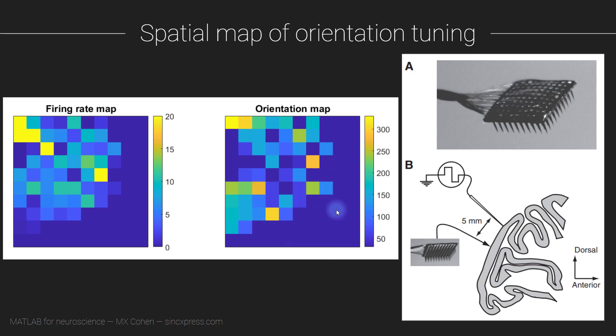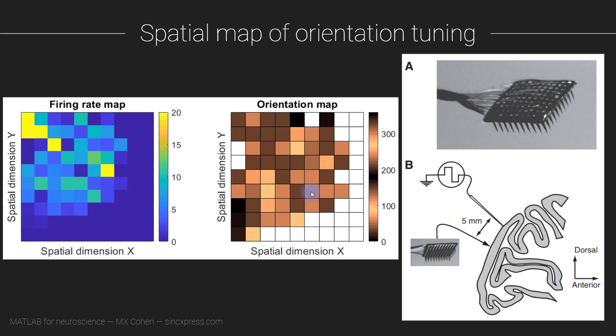We're going to solve both of those problems by using a different function for the visualization and by using an alternative and more appropriate color map. So you can see that this color map has the same colors for zero, 180 and 360, and the same colors for 90 degrees and 270 degrees.